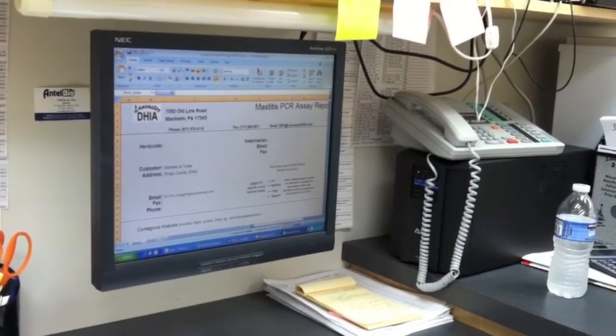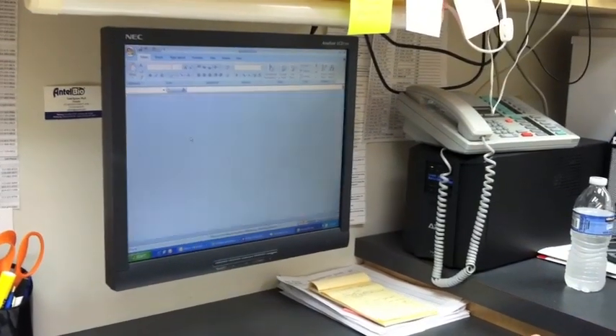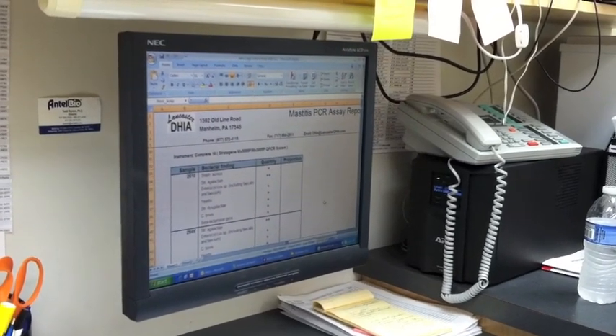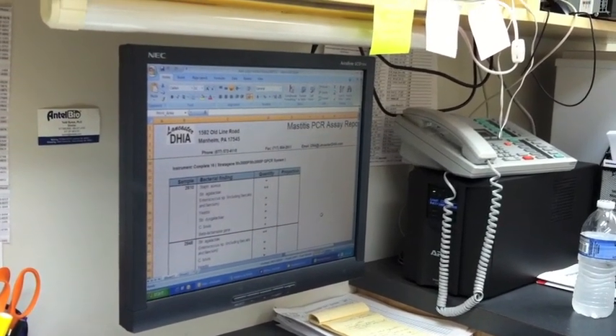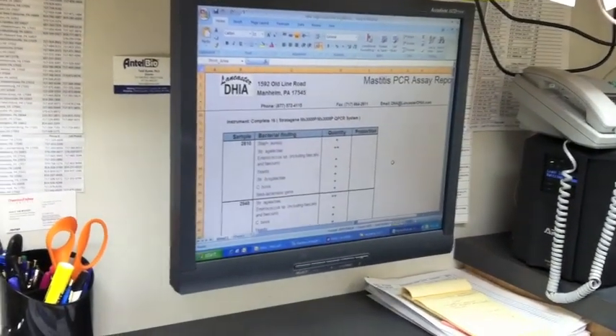That one was for the contagious test. For the complete 16, you can see there are a lot more targets showing positive, and it gives each one an individual ranking — low, medium, or high.